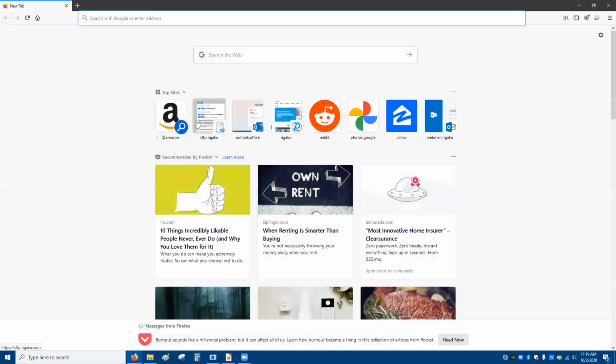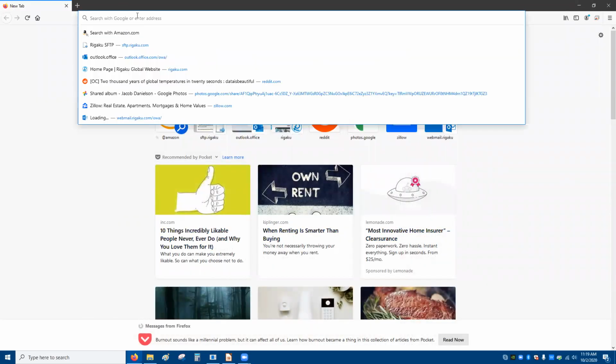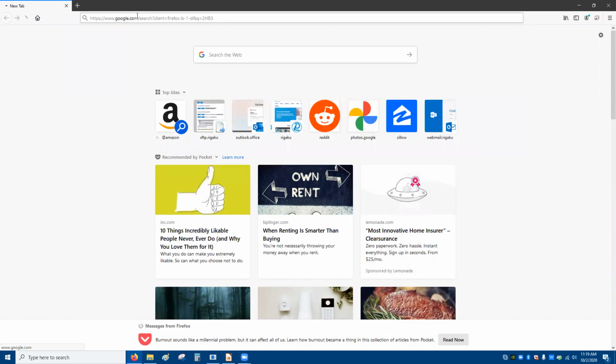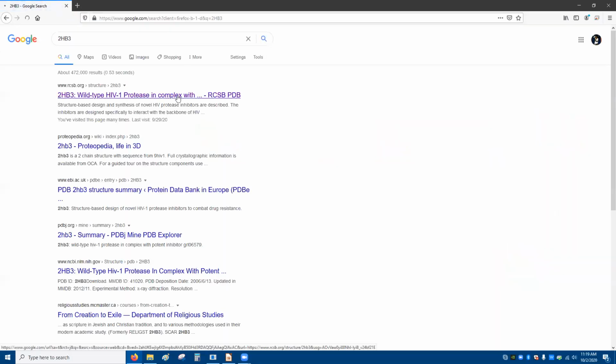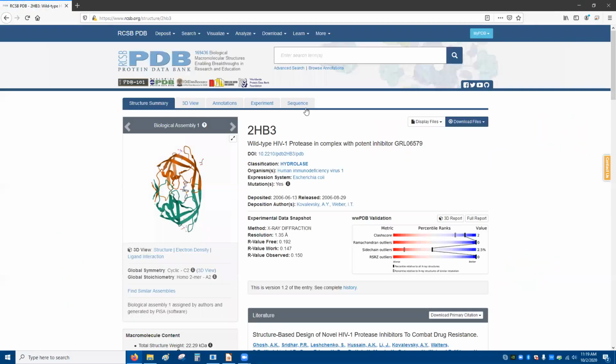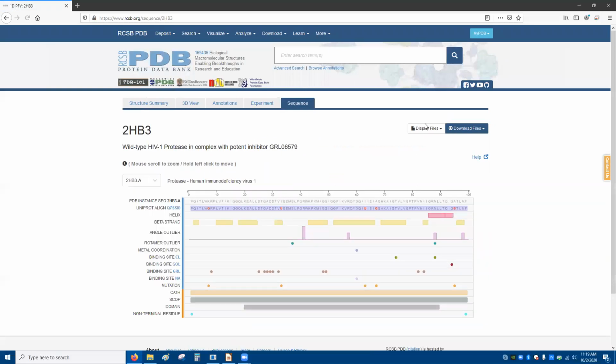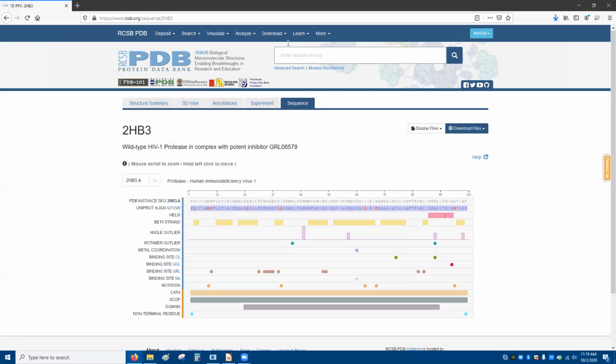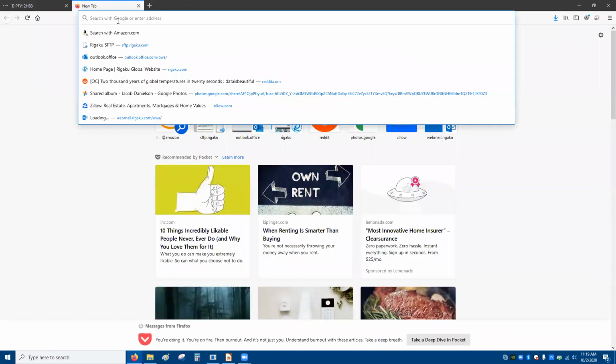So now we're going to get our tools. I need a target sequence. In this case, I'm doing an HIV-1 protease, which is part of another gene. So we're going to get the sequence, in FASTA format. Let's save it for right now.